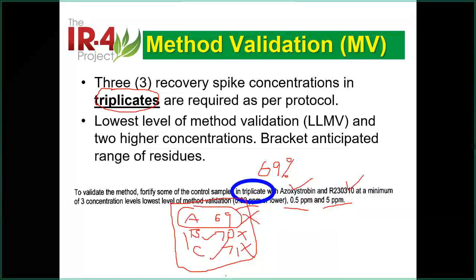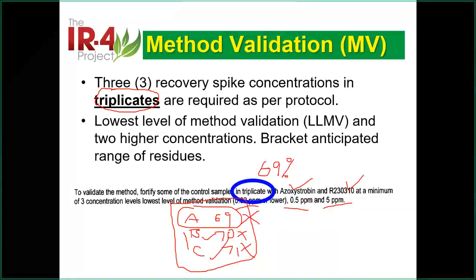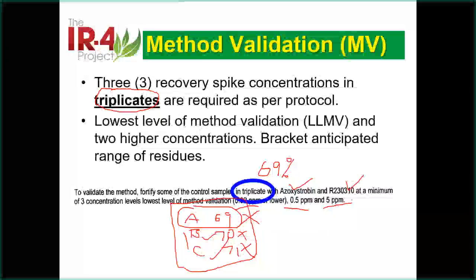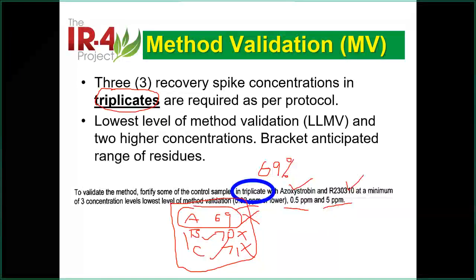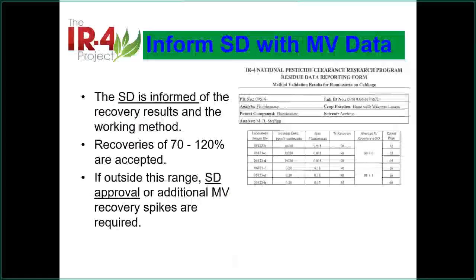Okay. So we made one mistake a long time ago. We were trying to collect all the data to calculate the LOD and LOQ, and that was a big argument with QA and other people. Scientifically, you are fine, but because they say triplicate means one sample, then if one is no good, out of range, everything is out of range, no good.